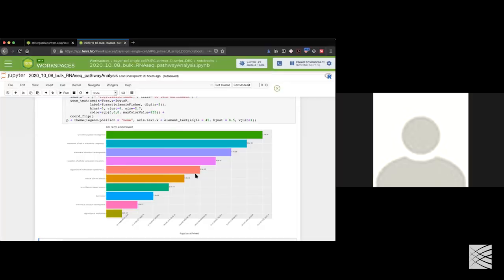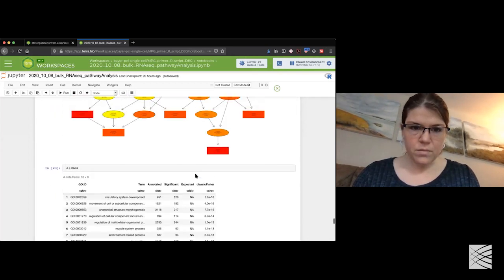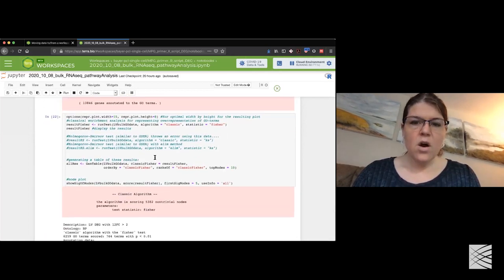There were just two quick questions that I'll ask before we take our break before the MPG session. One was just getting back to that KS test within TopGO. Do you feed in the log fold change or the Q value when you do that test? Yeah, so we feed it, oh, you're saying for the test?